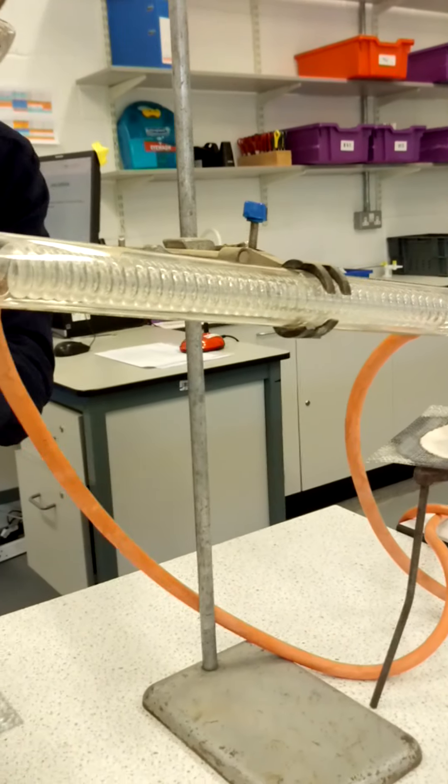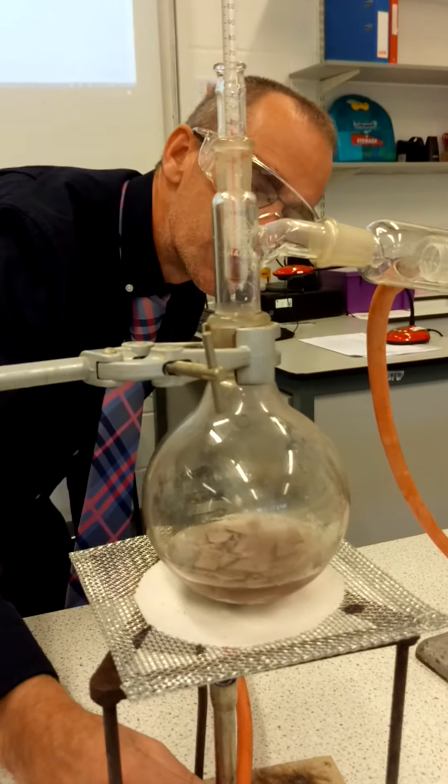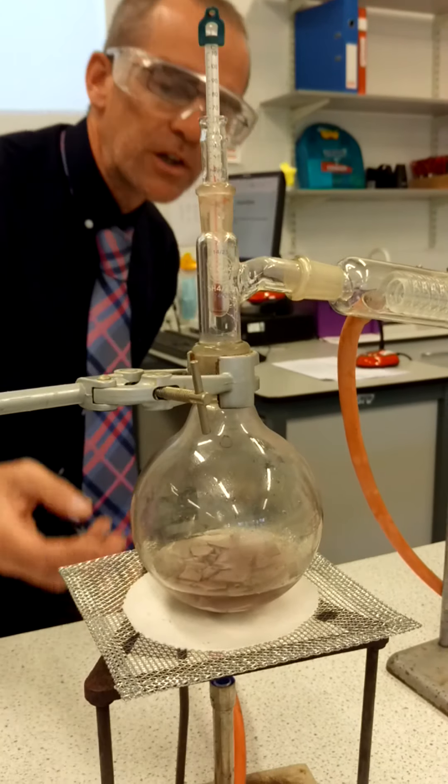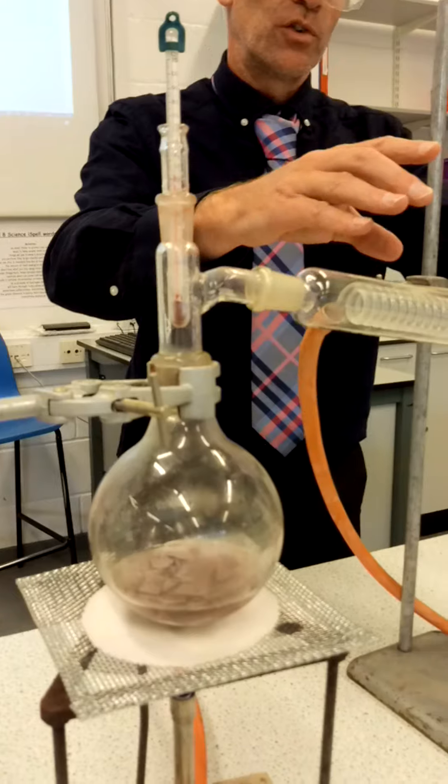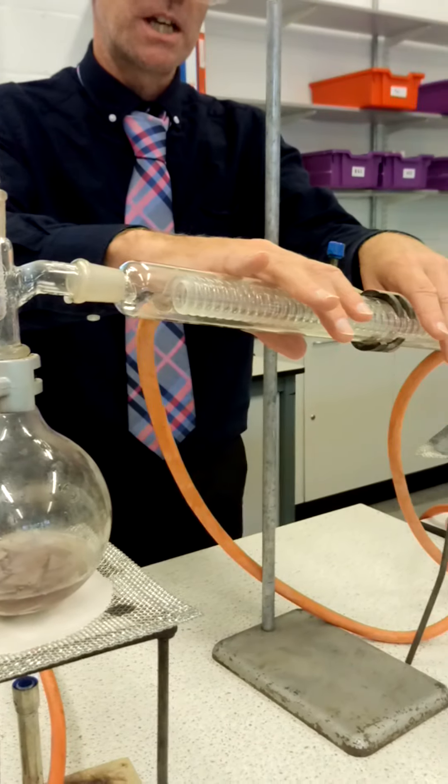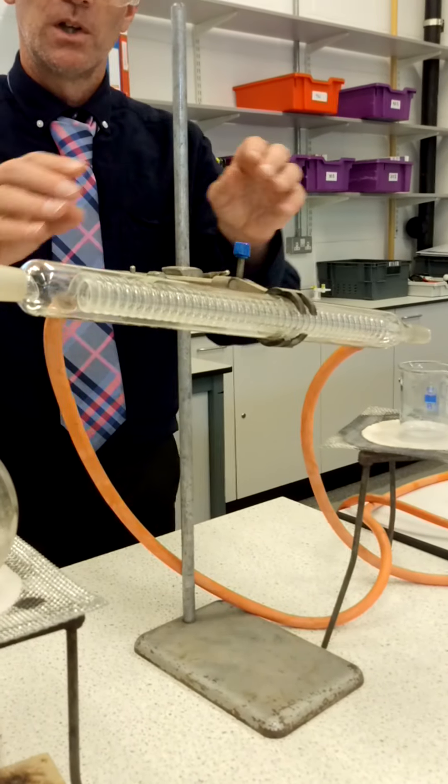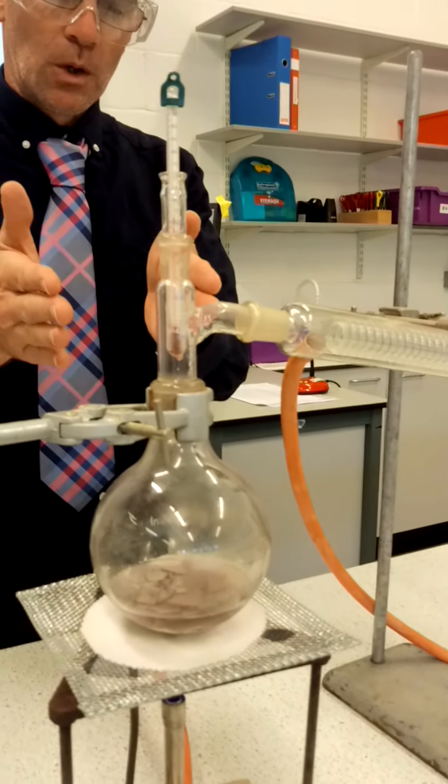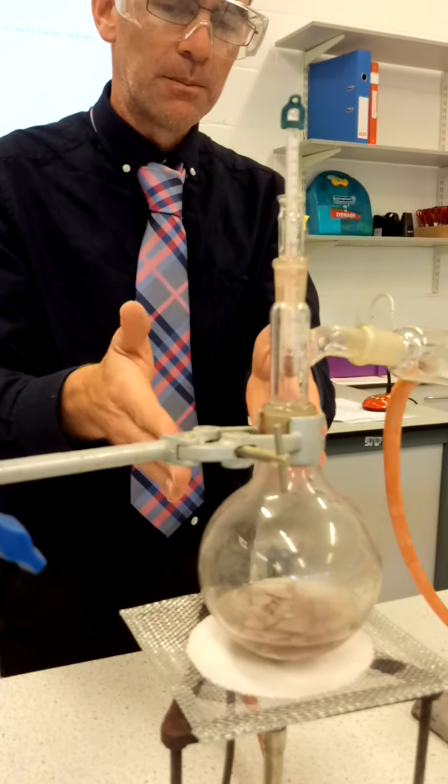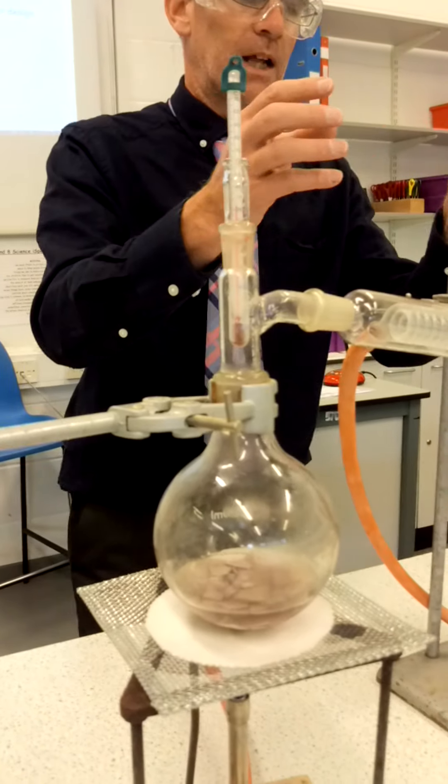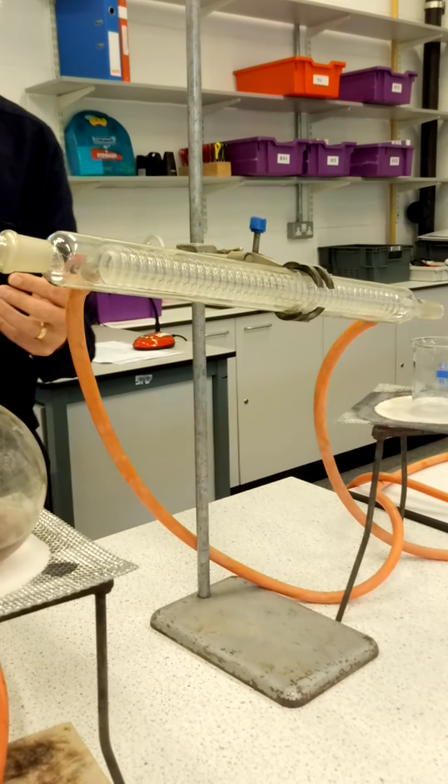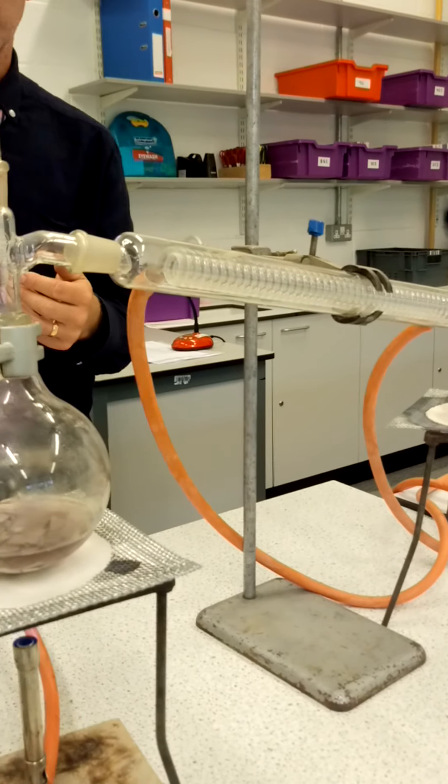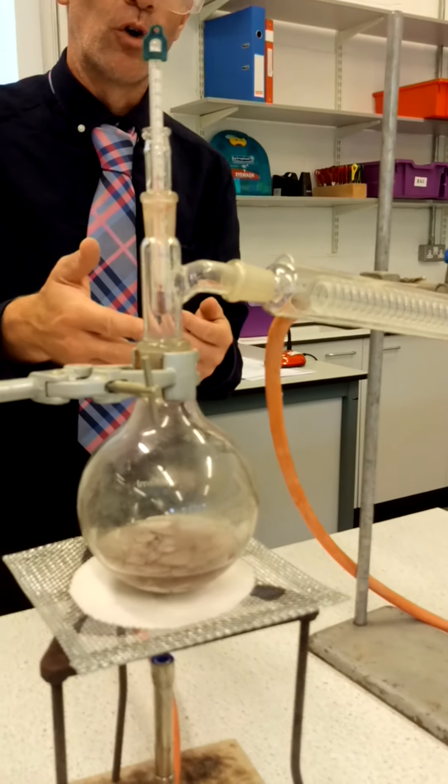So we've got heat here, which will hopefully be making things boil and evaporate. And a condenser here, which is going to stay lovely and cold. So there are going to be two processes going on. We have evaporation here in a minute, and condensing going on here. And what I want to know is, can I separate the ethanol from the water?